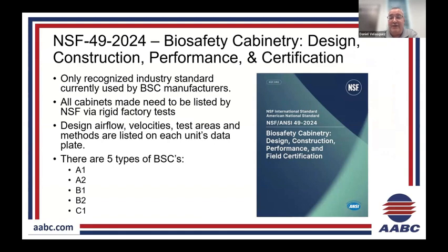This is one that definitely can throw a lot of curveballs at balancers, especially if you've not really gotten into the certification world. You can definitely expect some struggles between the certifier and the balancing firm. The biggest thing right now is NSF 49 is the only recognized industry standard out there for BSC manufacturers. There are other organizations starting to tinker with their own certifications for BSCs, but right now all the major players only use NSF 49.